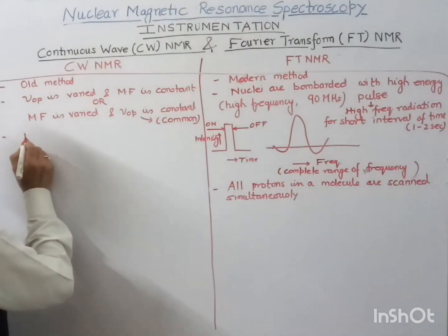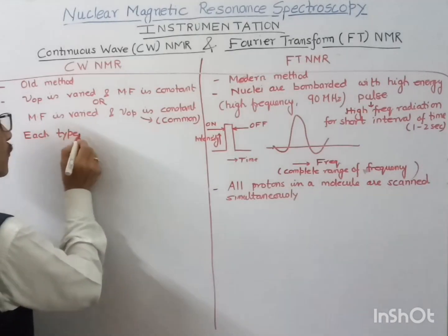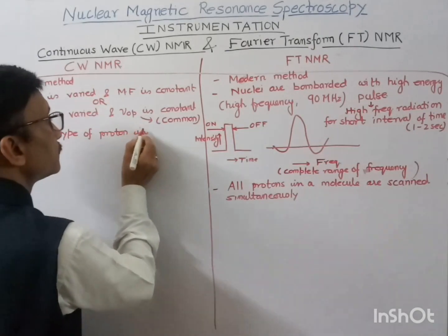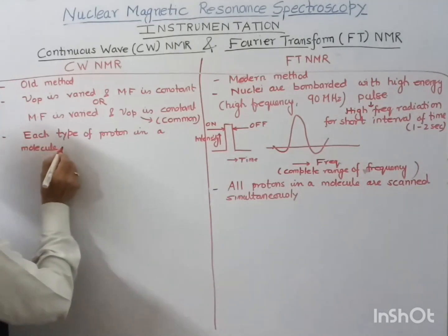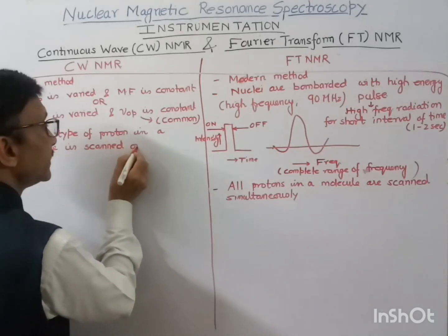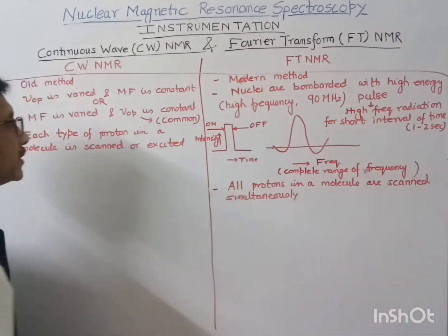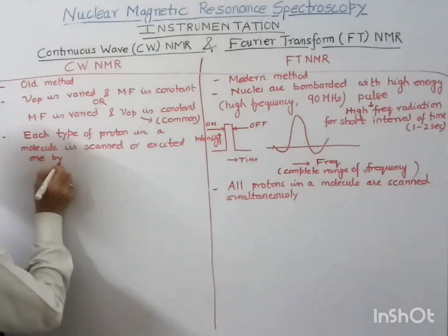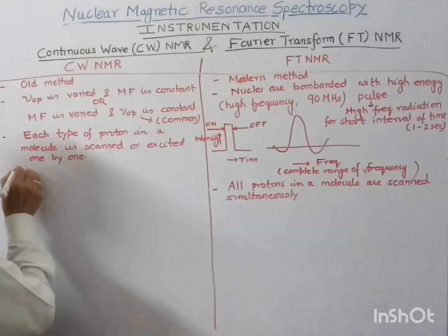Each type of proton in a molecule is scanned, or we may say excited, one by one.